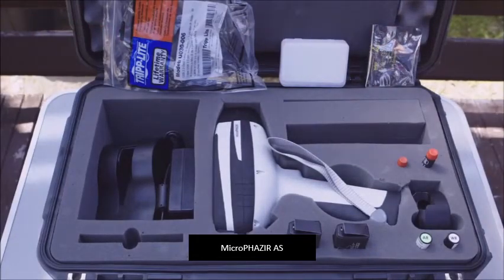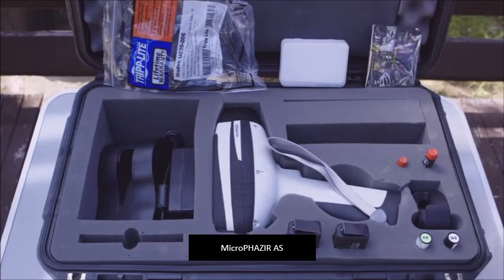Hello and welcome to the introduction of the Thermo Fisher MicroPHAZIR AS Asbestos Analyzer. I'd like to just walk you through what is going to be supplied and what components are in the instrument case when you receive it.